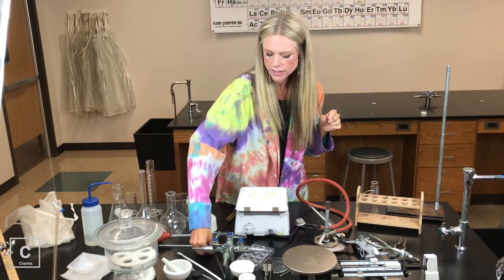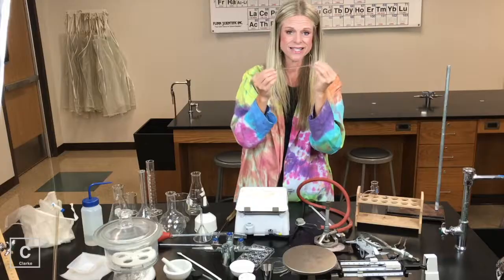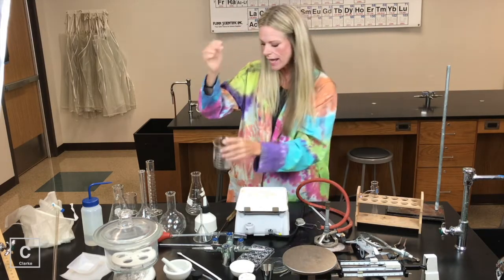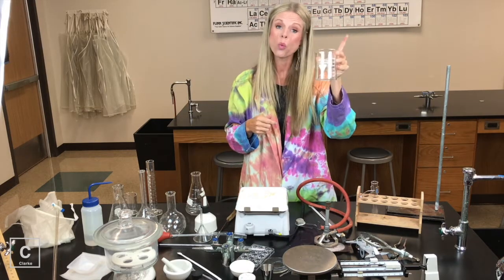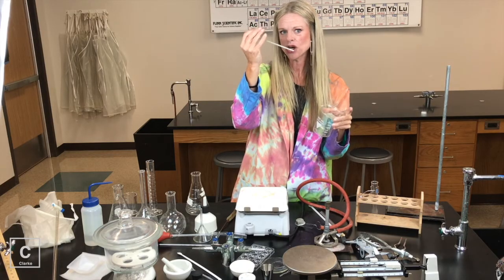Another piece of glassware is a glass stirring rod. Glass stirring rods — as innocent as this looks, and it is exactly for what it sounds like — we're going to stir chemicals with this. It's glass. A lot of equipment in chemistry is glass because glass is not very reactive, so you can put acid in here and not worry that the acid is reacting with the container holding it. Glass stirring rod.